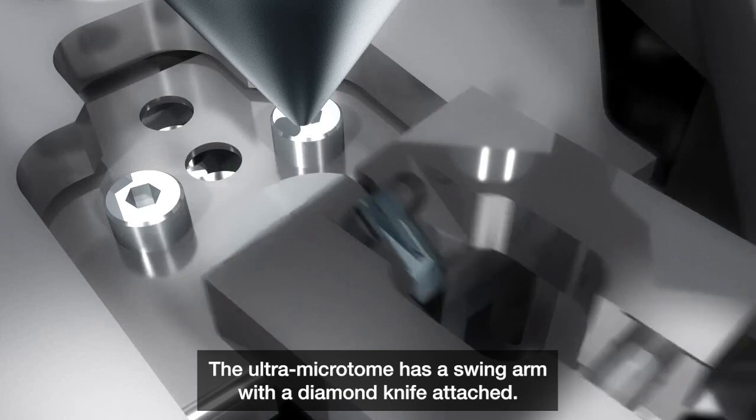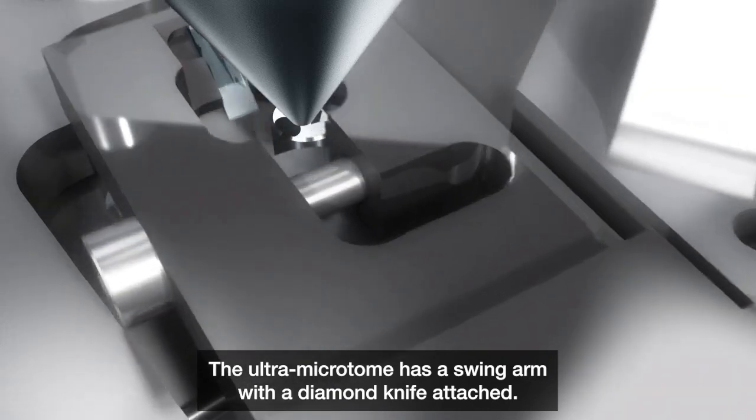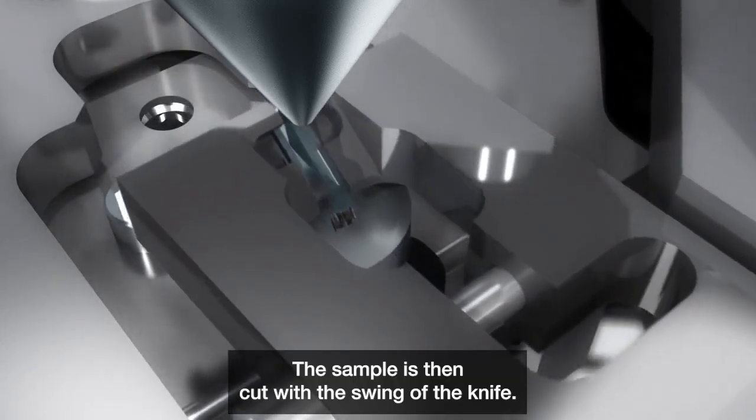The Ultra Microtome has a swing arm with a diamond knife attached. The sample is then cut with the swing of the knife.